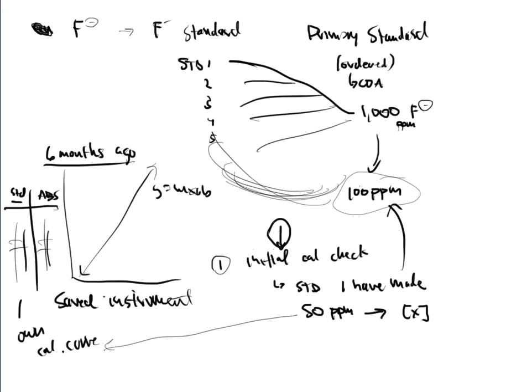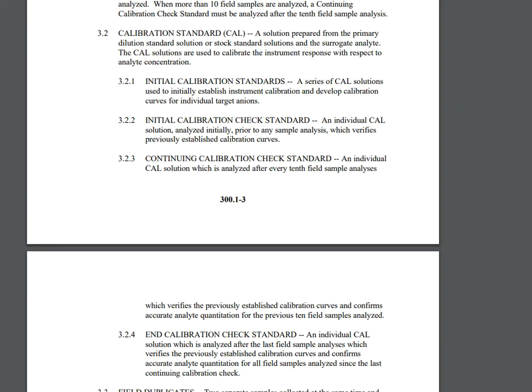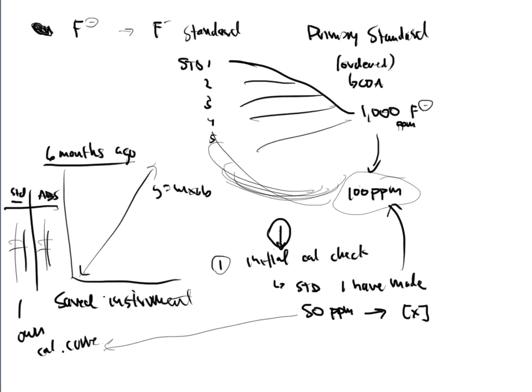And if you were part of the 114 course, you've done this method or something similar, and you walked through these steps. And this is the reason why. We wanted to make sure that this calibration curve that you made was legitimate. And if you made a 50 ppm over here and you cross-reference it to a calibration curve that maybe was done weeks ago, days ago, months ago, these should check out.